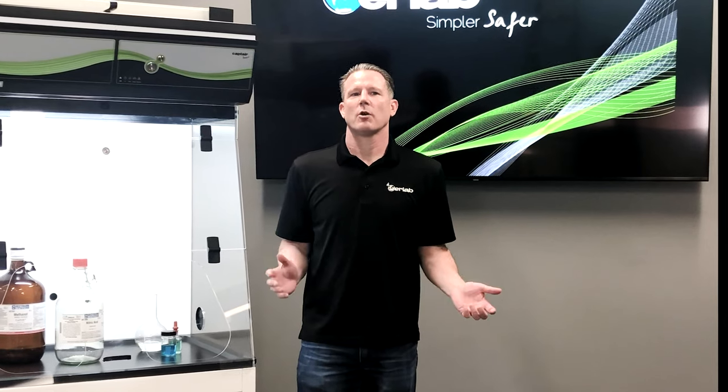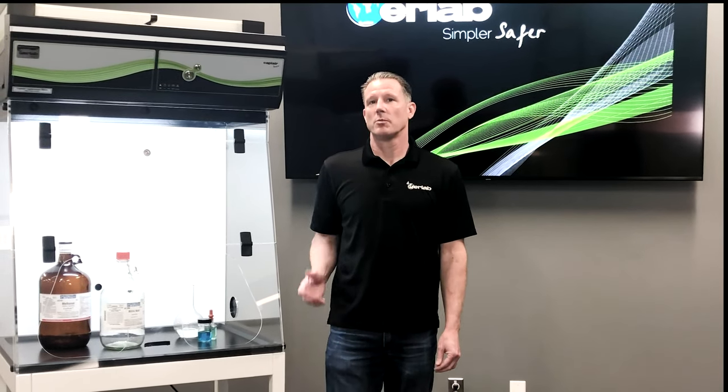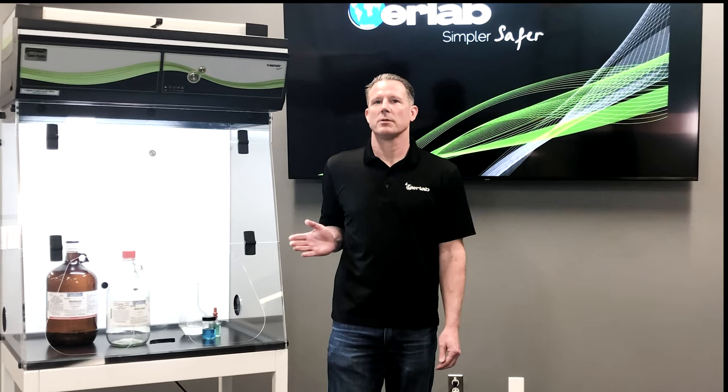Since it does not require any ductwork or an exhaust, it can be set up and fully functional within minutes and anywhere in your laboratory. The fume hood model next to me is our most popular — it's a 321.